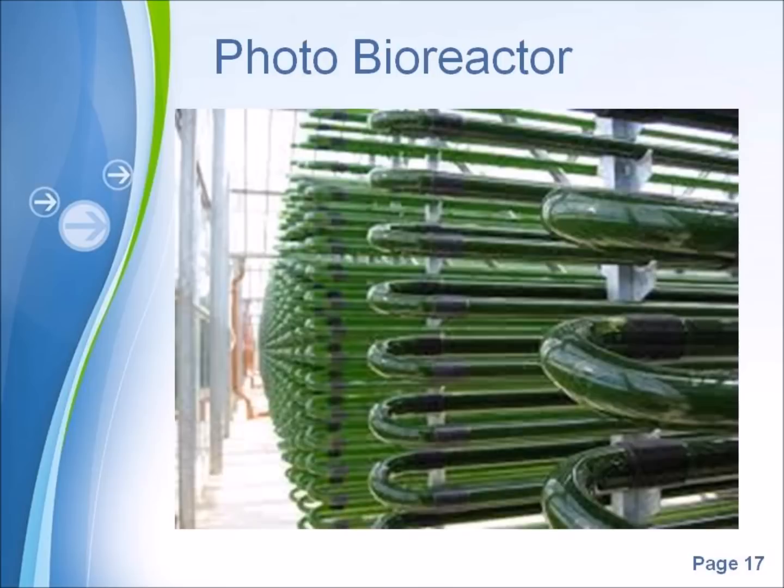Photobioreactor. A photobioreactor is a type of bioreactor which is used to cultivate phototrophic microorganisms, or organisms which grow by utilizing light energy. These organisms use the process of photosynthesis to build their own biomass from light and carbon dioxide. Members of this group are plants, mosses, macroalgae, microalgae, cyanobacteria and purple bacteria. The key objective of a photobioreactor is to provide a controlled supply of specific environmental conditions for respective species. Thus, a photobioreactor allows much higher growth rates and purity levels than in natural habitats or habitats similar to nature.